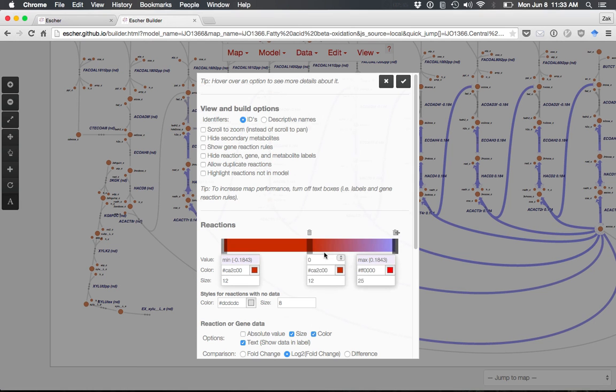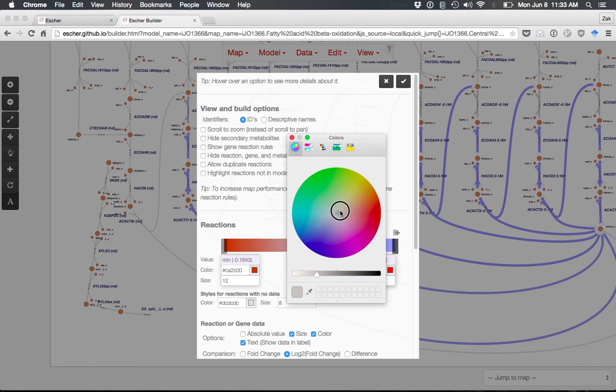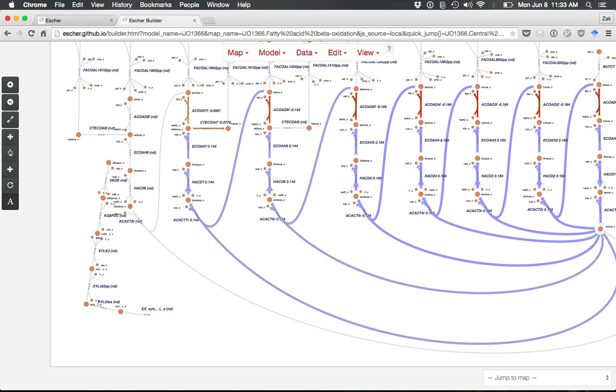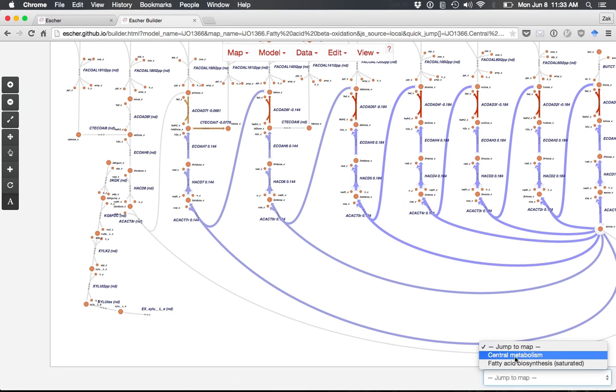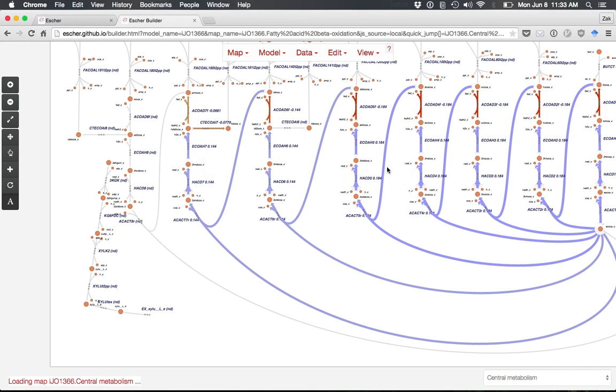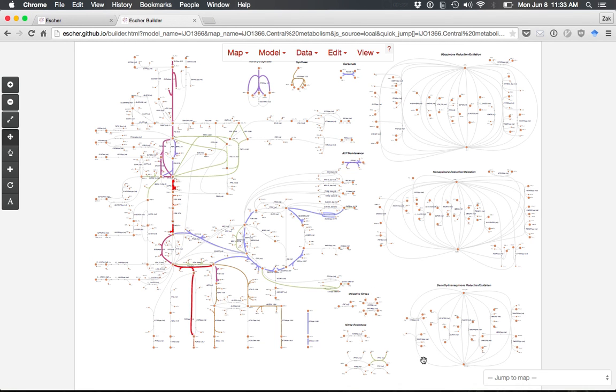Basically everything is editable. There's also a quick jump menu where you can jump to different maps, such as the Central Metabolism Map for E. coli, and all your reaction data and settings will be maintained as you switch between pathway maps.